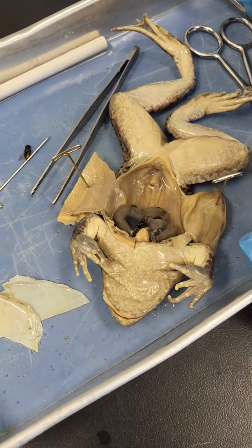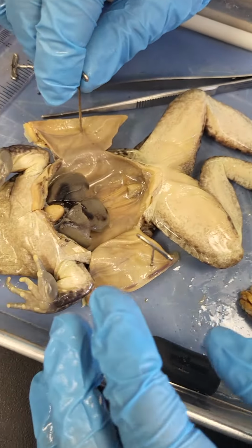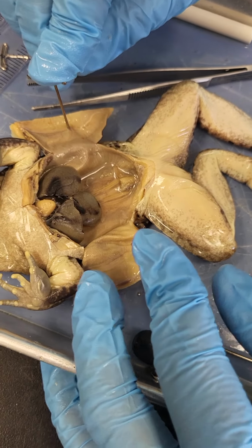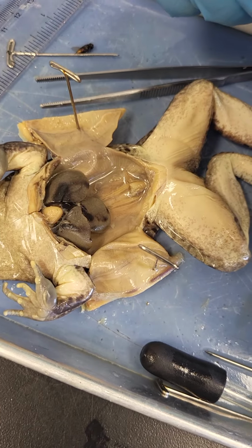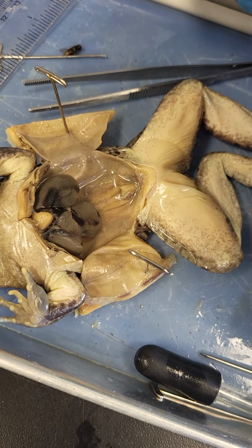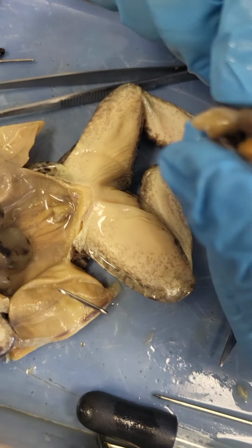The frog's reproductive and excretory system is combined into one system called the urogenital system. You'll need another structure for both male and female frog. Of course, kidneys. You had to spill all the juices. They're on the lower back of the frog near the spine. It should be down there in the photo, but I don't even see it. Is this a kidney? This is a kidney.